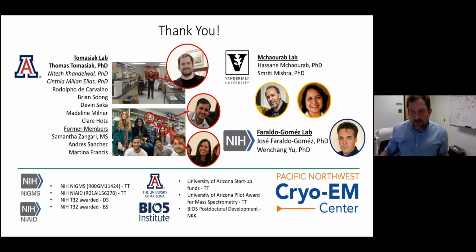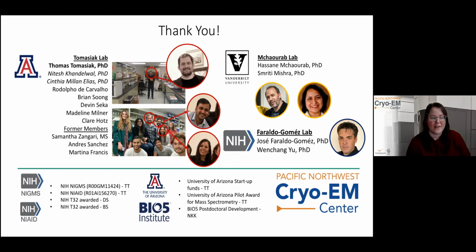Awesome. Going back to some equipment questions. Obviously you guys did a great job covering how you built your resources, but can you comment on the capabilities and performance of your Leica GP2 relative to a Vitrobot or other options for sample grid preparation? Yeah, absolutely. So I will say I wasn't here yet when we bought the GP2. That was entirely Tom's decision. And I am a creature of habit. So if I had been in the lab, I would have probably advocated for the Vitrobot.